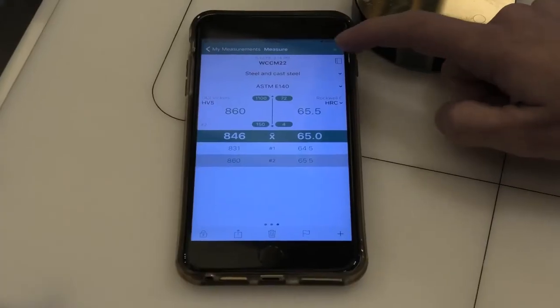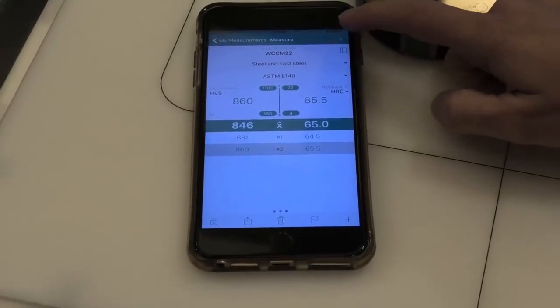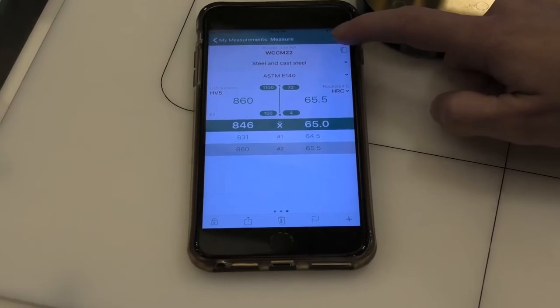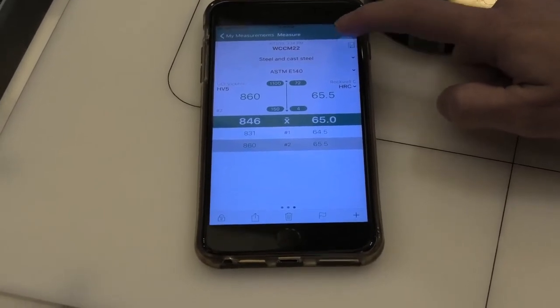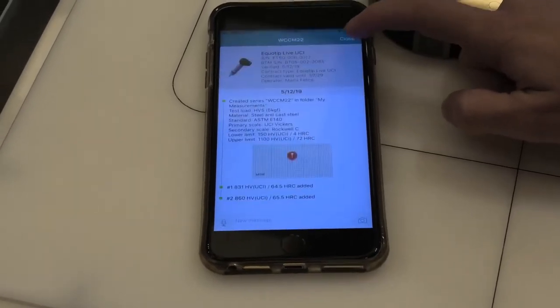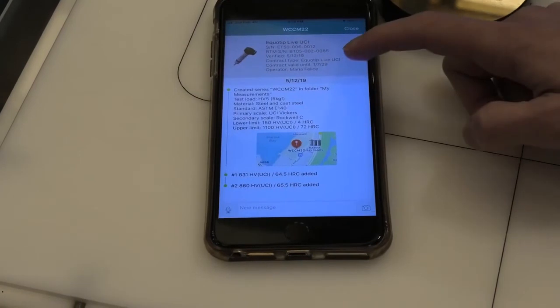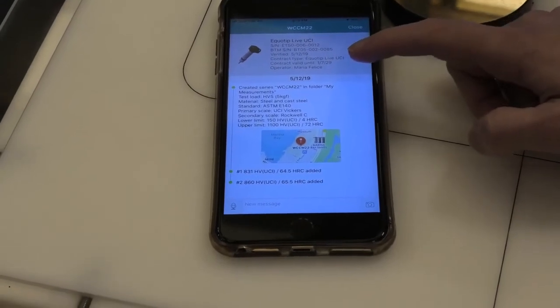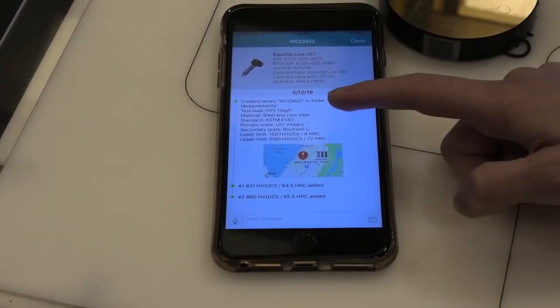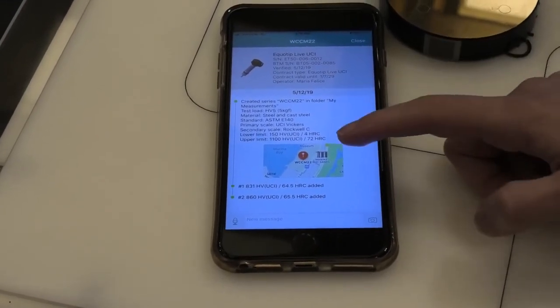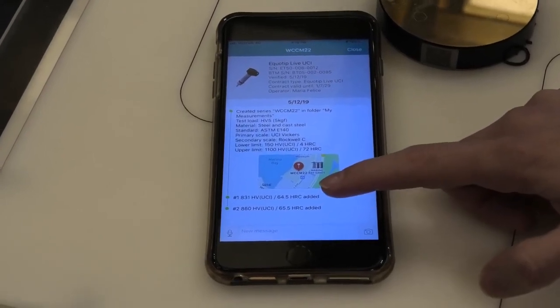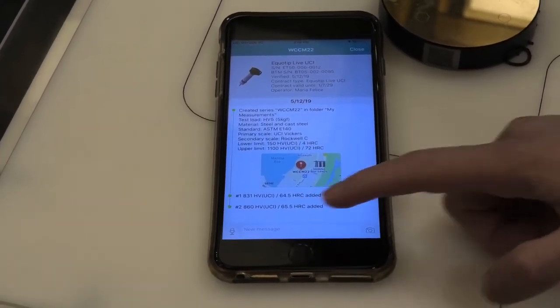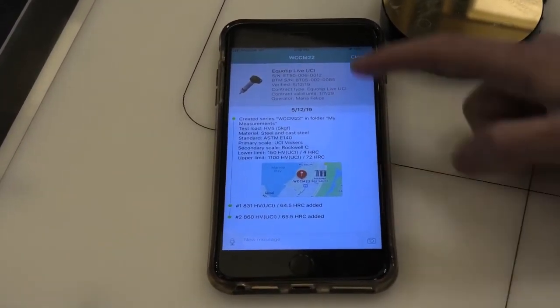So here we have the log book function. If I click on the little log book picture, I can see the serial number and information about the probe, and also a map showing my location, and the measurements that were taken. And I can add comments and photos.